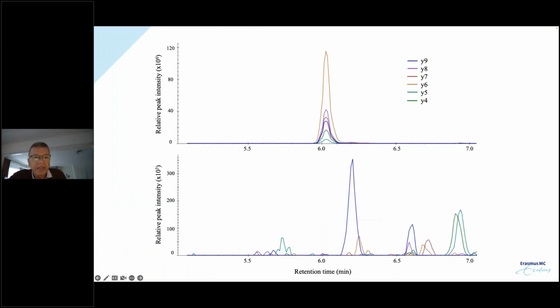So, just giving you an idea of what is happening. If you have such a sample, with a sample time of 10 minutes or this kind of order, and you use this MRM, a targeted way of finding the peptide, you can find the peptide in the upper panel, and in the lower panel we don't find anything. We can only find the masses sometimes, but for sure not the transitions as mentioned above. So in that way, you can also give a kind of quality value to this kind of measurement, and that can be done exactly using this software. Next slide, please.